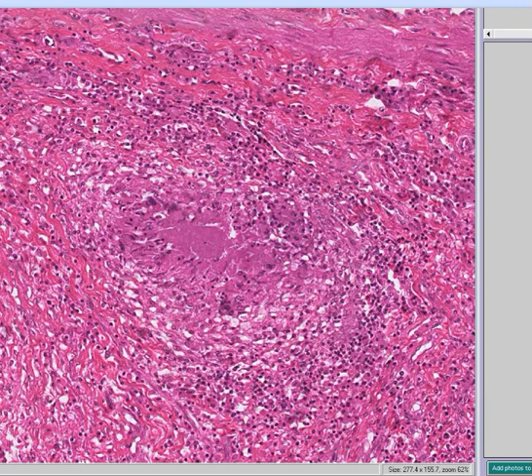Yeah, I know you're looking at the old one. In about 5 seconds, you'll see a nice piece of liver here. We might not get the chance to go through all the liver slides, but remember, we showed pictures of them, and we started to do a few of them, and we had a whole lab where we did liver when we were on the island. So I'm guessing that by now, almost everybody here is looking at liver, right? Oh, I see a nope, nope, nope. Well, hold on. Let me get rid of that old crappy thing then.